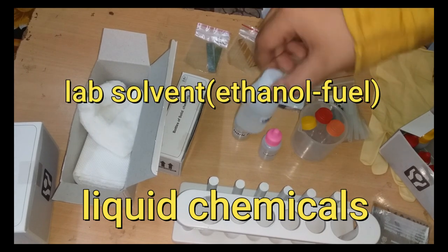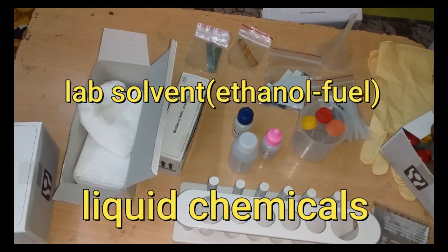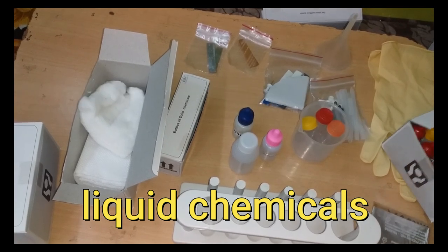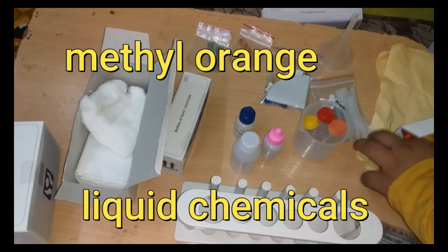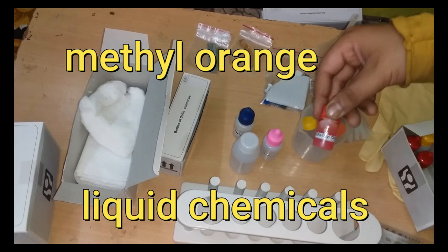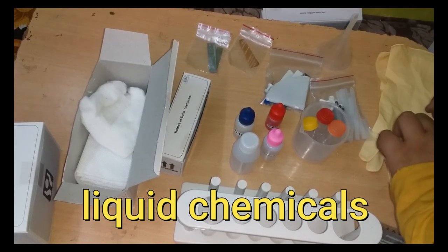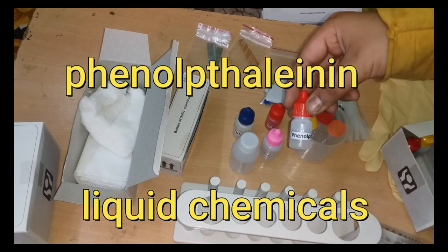This is lab solvent ethanol - it can be used as fuel in the burner. And now it comes methyl orange and phenolphthalein.